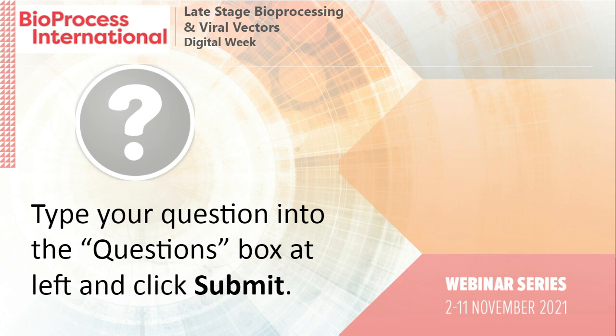Okay, great. The next question: will partially full AAV be detected on your ddPCR method?